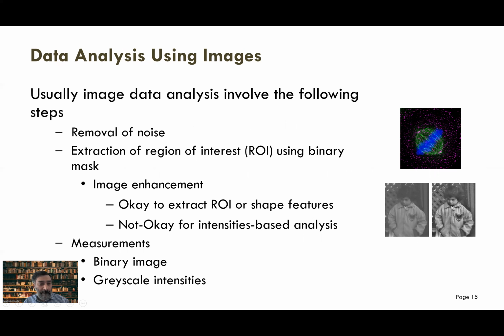So when we do the data analysis tasks, this is my own pipeline. It's not a general rule of thumb. It's just for the practice that we're going to do with these images, where we're going to look at the size of a spindle or the size of this DNA.